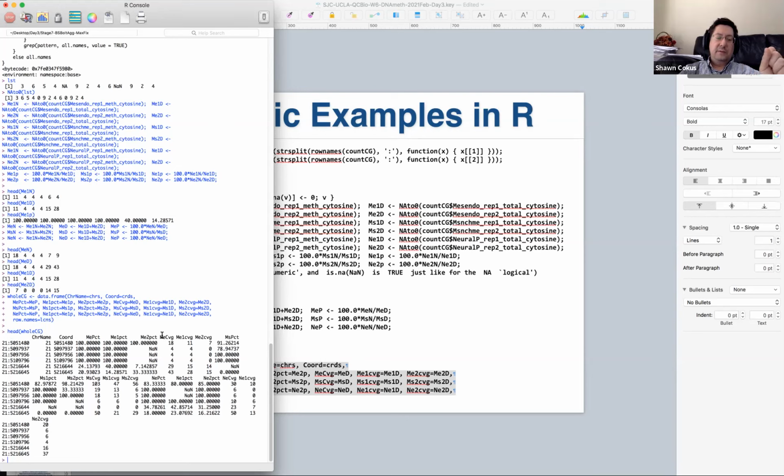And we've got the coverages for all 6 samples and all 3 tissues, pooling samples. We've got column names that are short enough to type and easy. This is now an efficiently usable guide, right? This is much better than the raw import was.